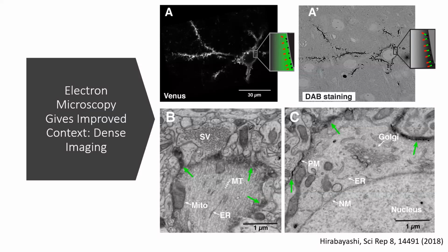So in this image, we have a fluorophore that has stained a neuron. And you can see that neuron, but the background looks dark. If you use DAB, it will precipitate on this fluorophore, so it clearly marks the cell of interest.